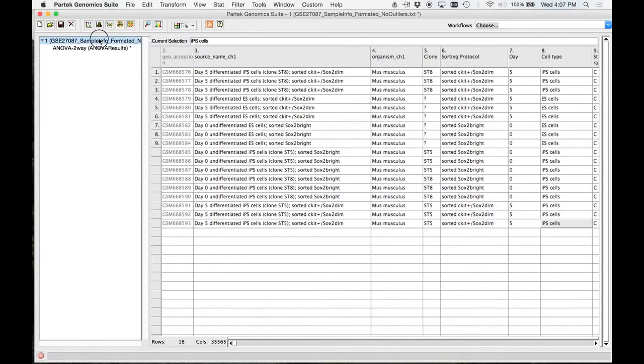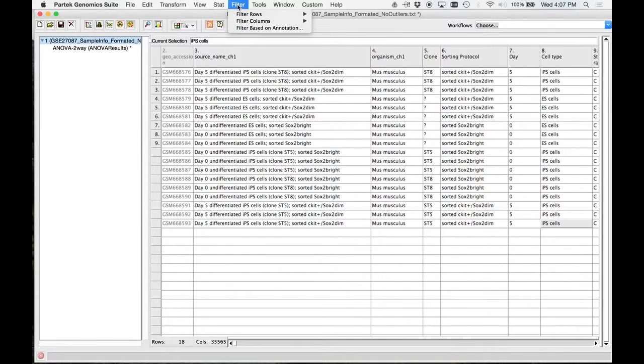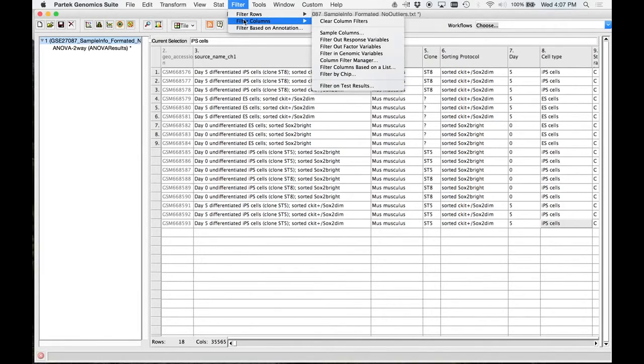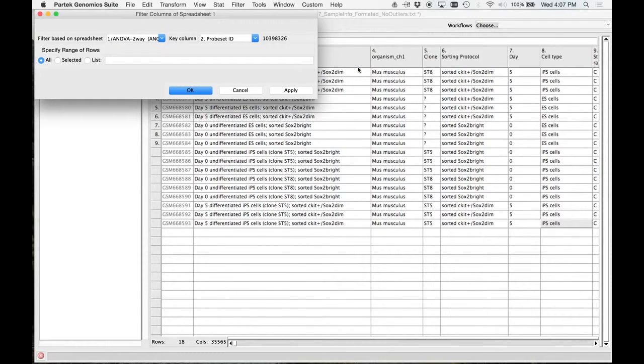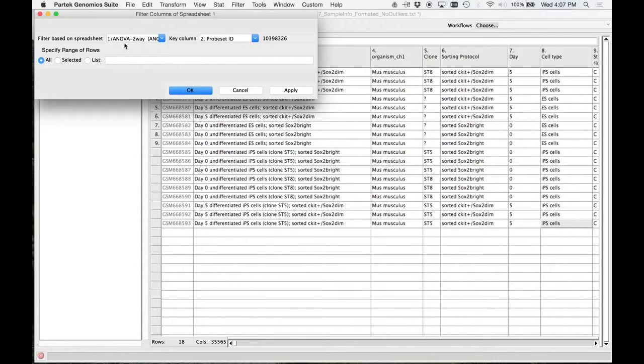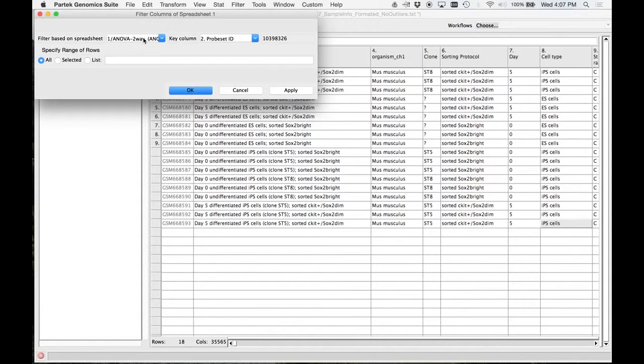So select your study. What am I doing here? Filter columns, because that's where your genes are. I'm going to say filter columns based on a list. Everybody see that? Everybody got to that menu? The key column here is probe set ID. They all have the probe set ID. So I'm going to hit okay. I'm filtering based on my ANOVA I just did, and my key column is probe set ID. Then I hit okay.